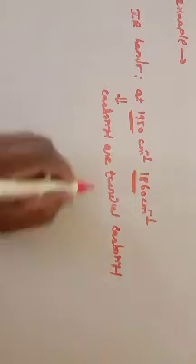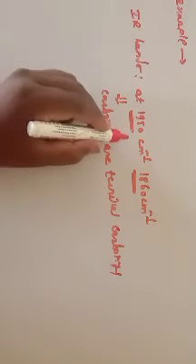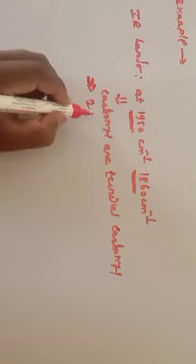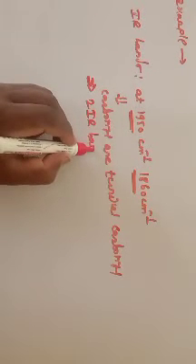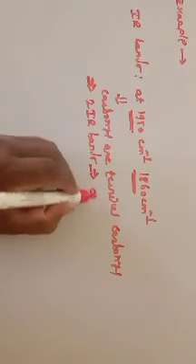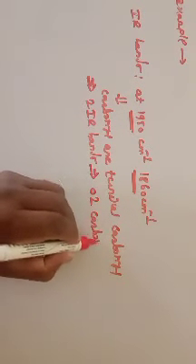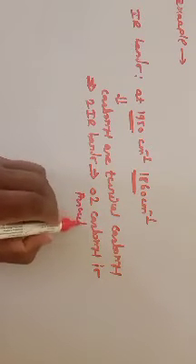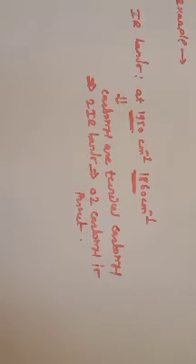So the carbonyls are terminal carbonyls, and two bands are observed, meaning two carbonyls are present. So we get two IR bands, indicating a total of two carbonyls present in your structure. The two IR bands indicate two carbonyls in your product, and the values indicate that the carbonyl present in your product is a terminal carbonyl. So you should keep that in mind.